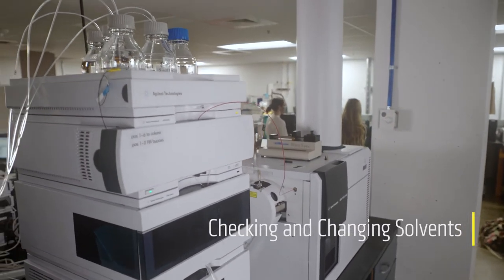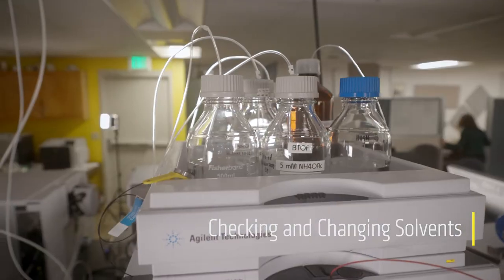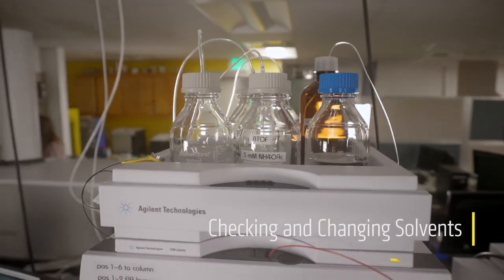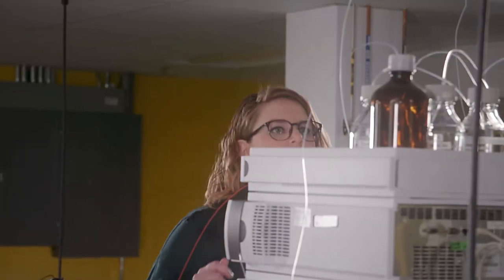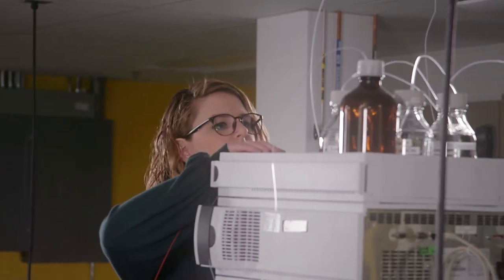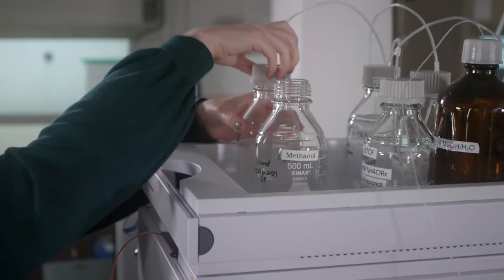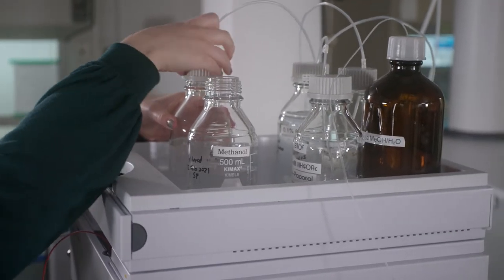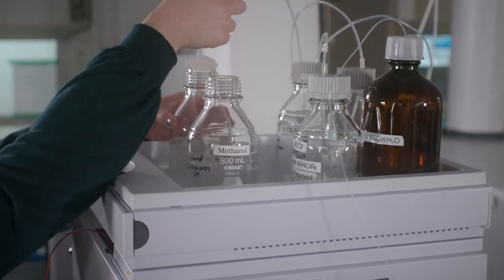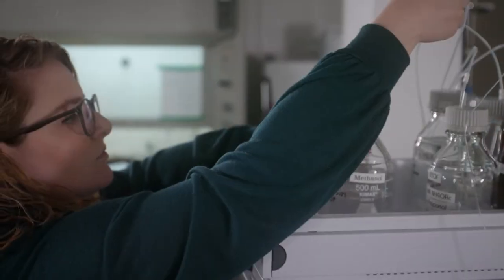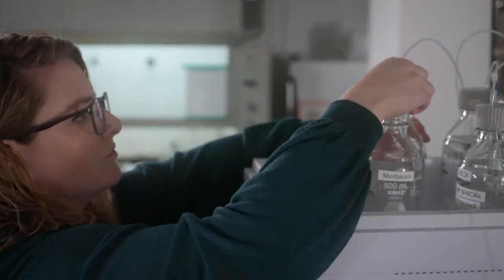This instrument has a binary pump, meaning that it can draw from two different solvent bottles simultaneously. If you need to change the eluent, locate the label on the tubing and on the cap to make sure you have the correct channel. Unscrew the cap and move the tubing and cap to the new eluent bottle. Cap the old eluent bottle with the other cap.